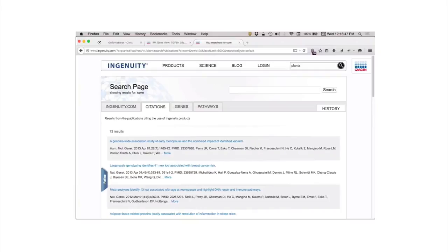And we have another question: infected versus uninfected, ratio of treated versus untreated, what they must mean? Basically, those are 2 conditions. You have expression values for one condition, like treated with something, or untreated is the mock condition. And those are the way people generally set up gene expression experiments, is something versus something, and it's that comparison. It's a differential expression that's always what you really want to analyze. That answers your question.